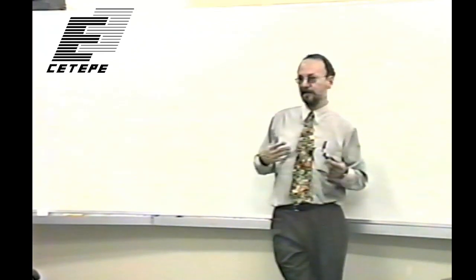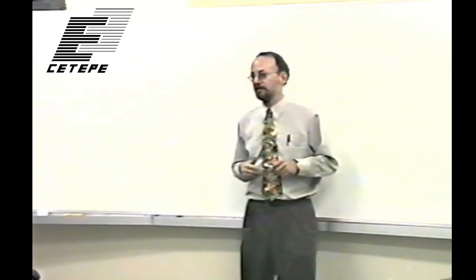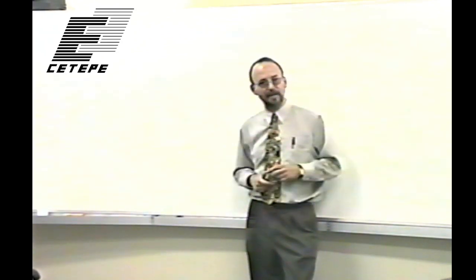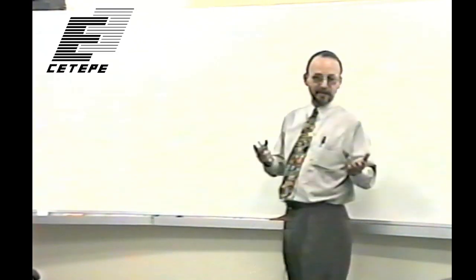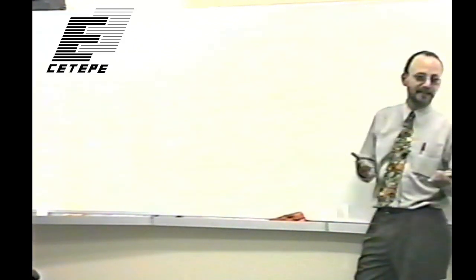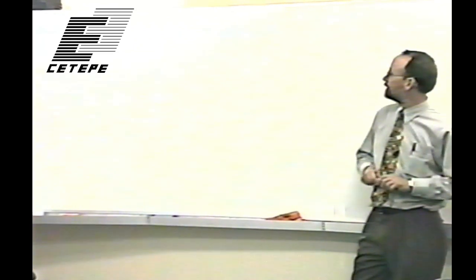And that's the whole concept behind what's sometimes called energy selective imaging, or it is the concept behind digital subtraction angiography, where you try to enhance the absorption of the object you're trying to see by the addition of some contrast agent, or maybe in research, oftentimes you have objects that just naturally contain an element whose K edge you can exploit for imaging.